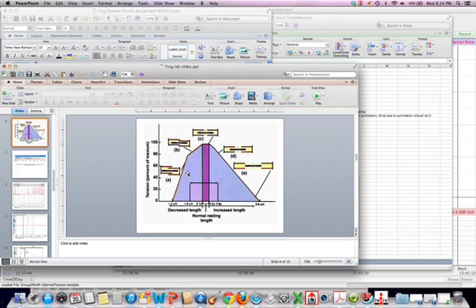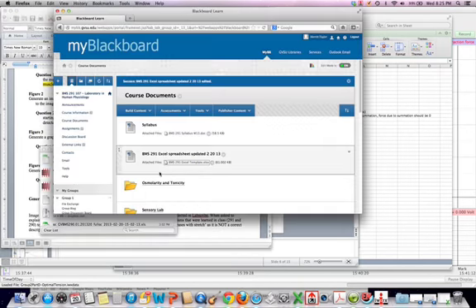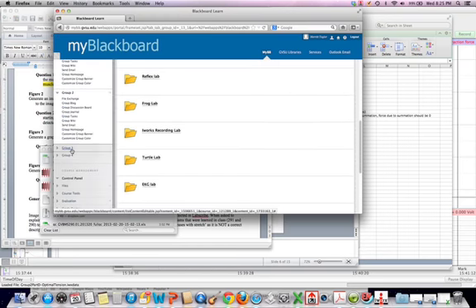So that was a very brief description, but I just wanted to give you a sketch of where to look for it and the concepts behind that particular figure. Figure 4 is looking at the force due to summation, so let's pull that one out and look at that. We'll look at another group for that, force due to summation. We'll look at group 3, pull it down, and file exchange.